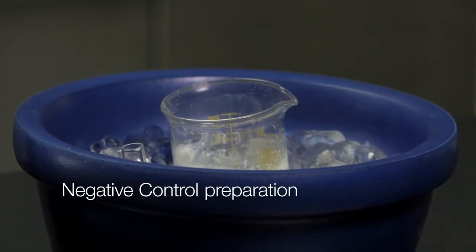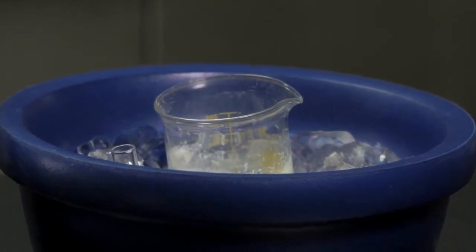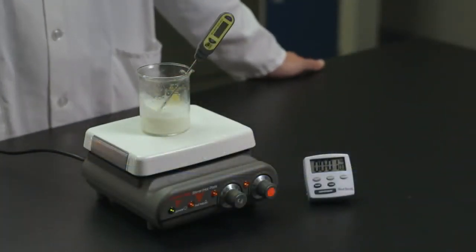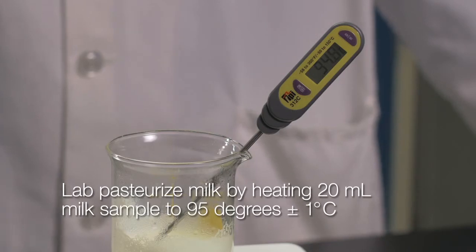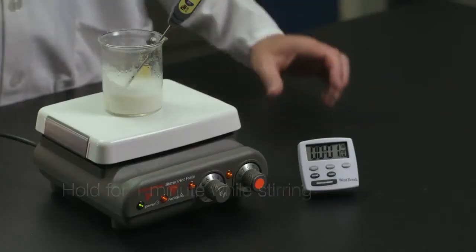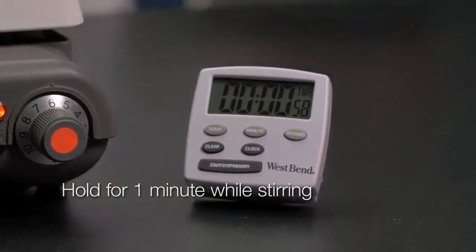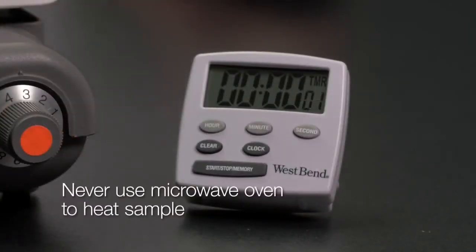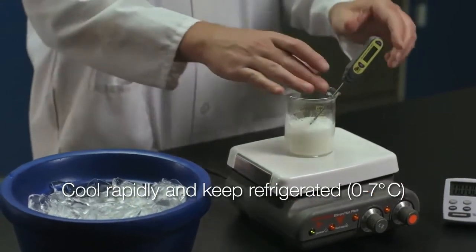To prepare a negative control, you can use a whole homogenized milk sample pasteurized within the prior 48 hours, or you can pasteurize your own sample. Heat at least 20 milliliters to 95 degrees Celsius plus or minus one degree and hold for one minute while stirring. Never use a microwave oven to heat the sample. Cool rapidly and keep the sample refrigerated.